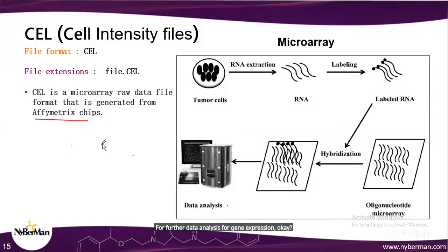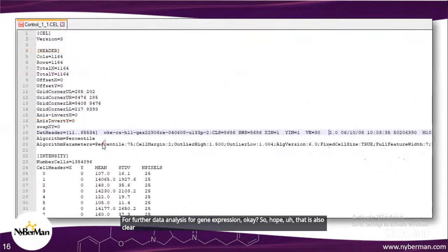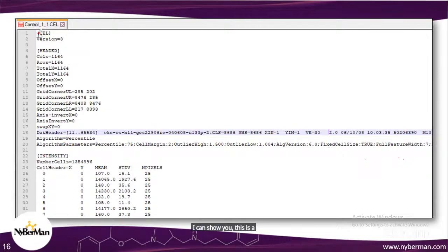Okay, so I hope that is also clear. Next, I can show you this is a CEL file where we have the header lines.